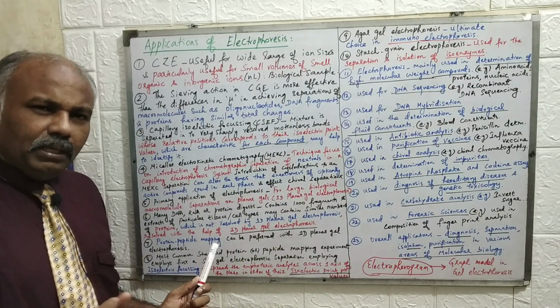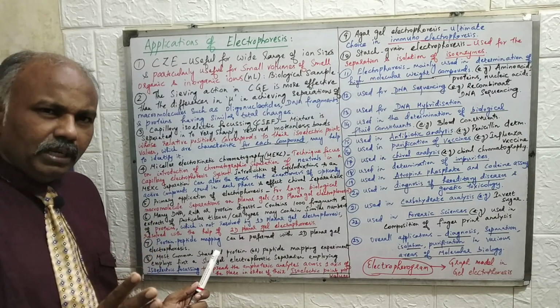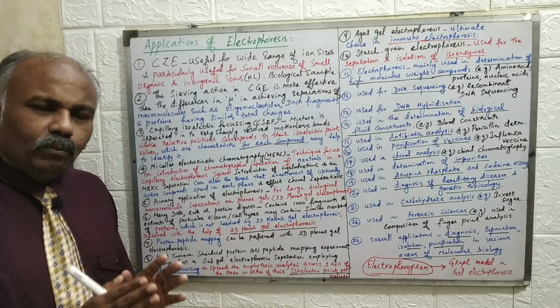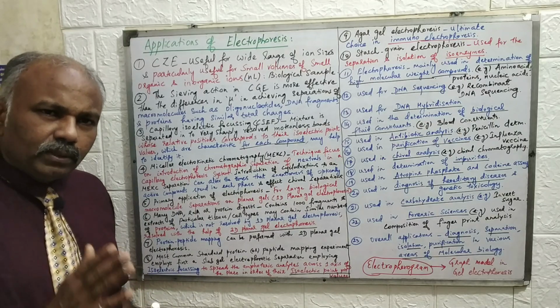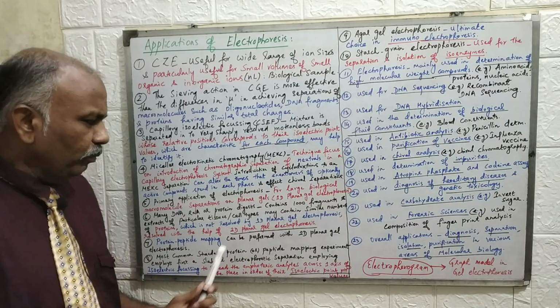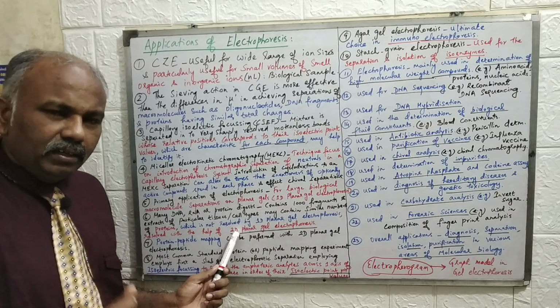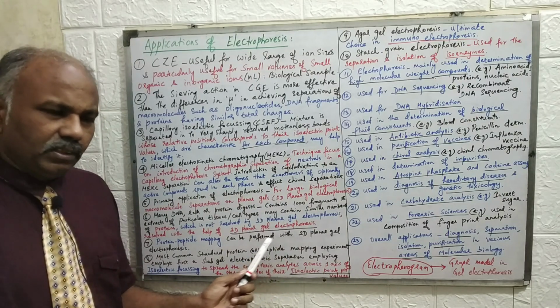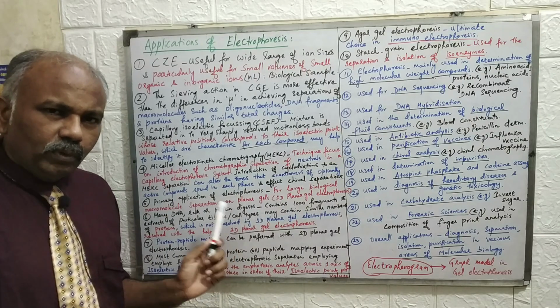They may have one type of protein and another type of protein. They have some similarity which you cannot resolve by separation in one-dimensional planar gel electrophoresis. So you must go for two-dimensional planar gel electrophoresis to resolve those particular compounds having similarity, right? So we are using two-dimensional planar gel electrophoresis. This is also one of the important applications of electrophoresis.